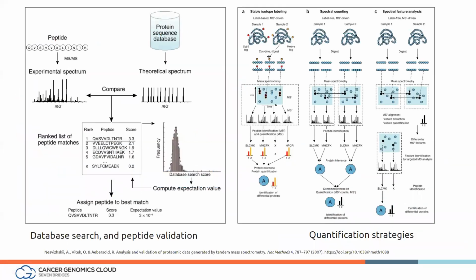So I noticed that some of you have never used a proteomics pipeline before. So I added this slide to go briefly over how the data analysis actually works. In a very similar way to the genomic analysis, the proteomic analysis happens in steps. And in each step, we process the data in a certain way that allows us to filter and quantify the peptides.